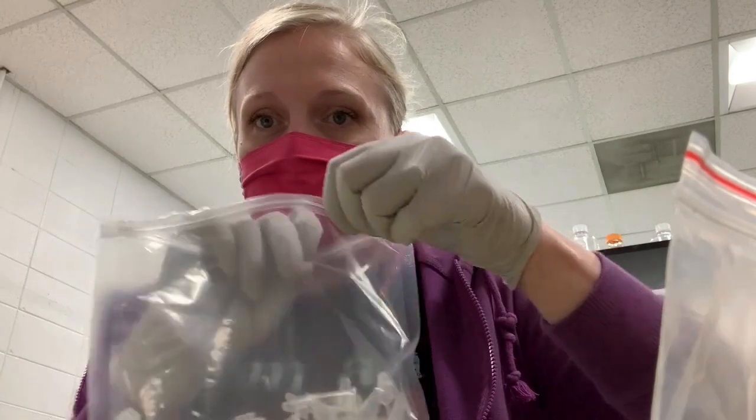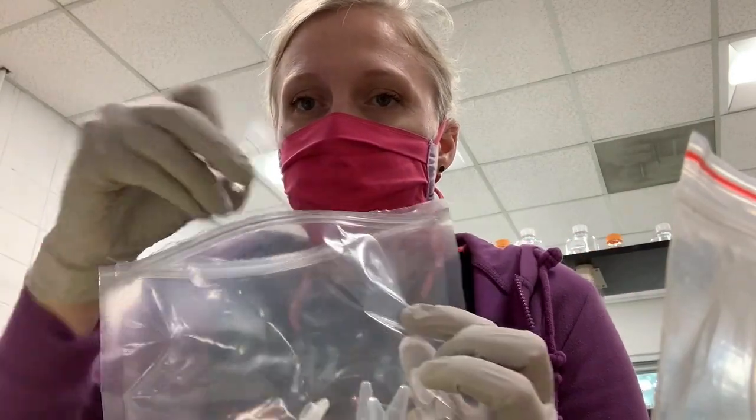So for each of your samples, you're going to have one of these, and you're also going to need one 1.5 ml sterile tube. They're in a bag like this. You can pull out one of them and cap it.